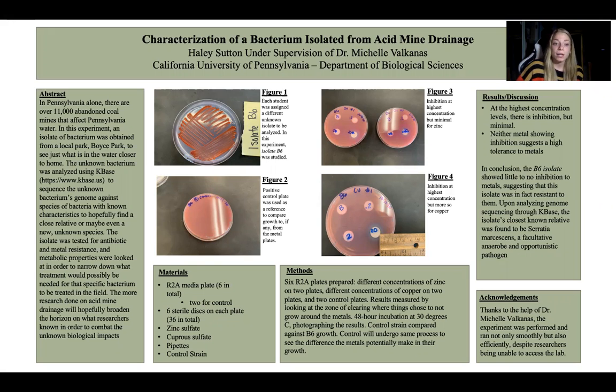In Pennsylvania alone, there are over 11,000 abandoned coal mines that affect Pennsylvania water. In this experiment, an isolate of bacterium was obtained from a local park, Boyce Park to be exact, which isn't actually that far from California University of Pennsylvania, just to see what is exactly in our water and if we should be alarmed with what is actually in there.